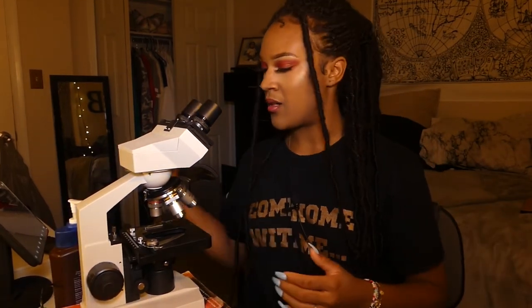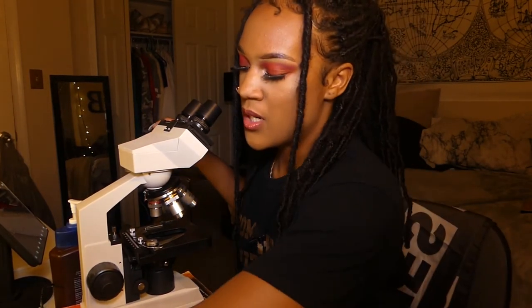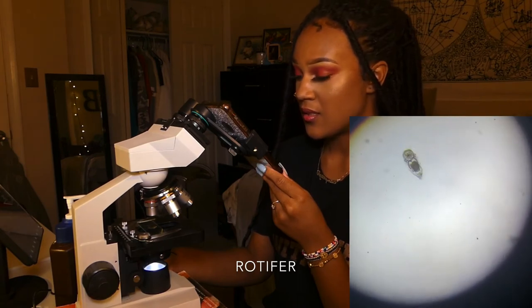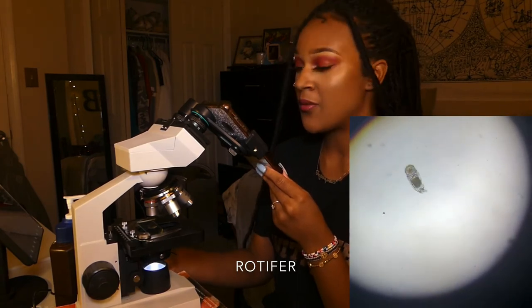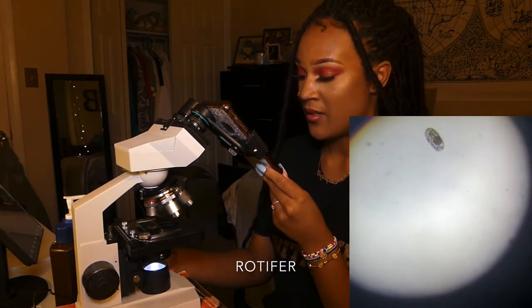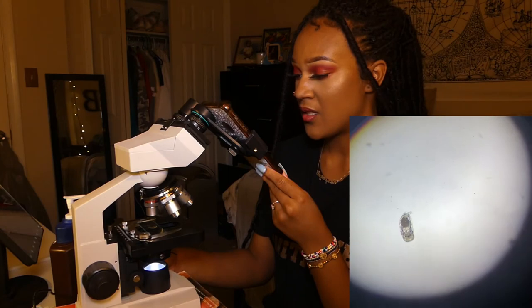Hey guys, we're back 24 hours later, and so my moss has been marinating in water for about 24 hours. And we're gonna see if we can see new creatures in the microscope. So I think you know the drill by now. I'm gonna attach my phone. What is this? This is at 4 times. So this is pretty big. I'm trying to see.